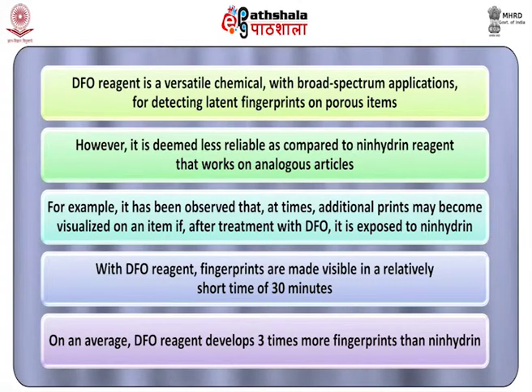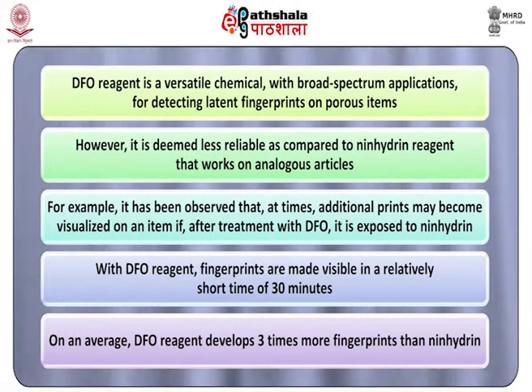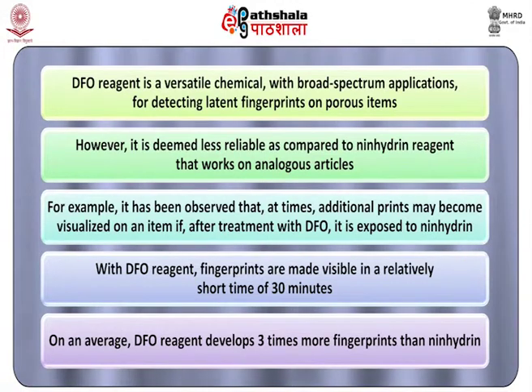Simultaneously, we have learned that, however, it is deemed less reliable as compared to Ninhydrin reagent. For example, it has been observed that at times additional prints may become visualized on an item if after treatment with DFO it is exposed to Ninhydrin.